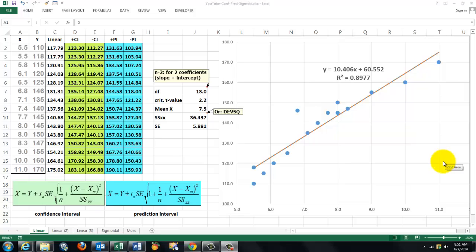In this video, we are going to do confidence and prediction intervals for linear regression and for sigmoidal or logistic curves, the simplest way possible.